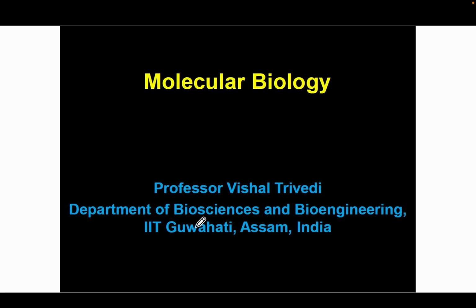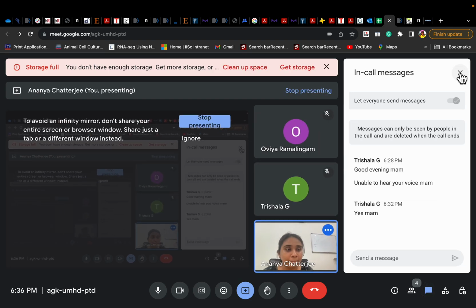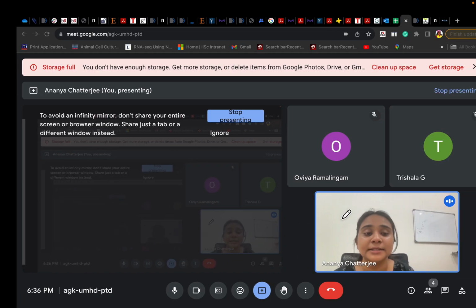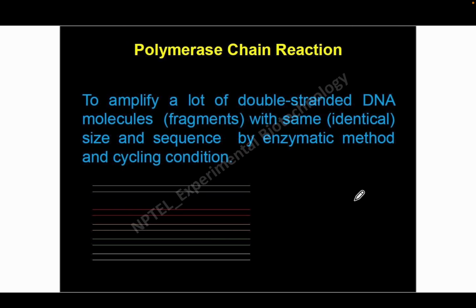Now today I will be starting with molecular biology, week 9 content. These slides are from Professor Vishal Trivedi, which you also see in NPTEL. So we will be discussing these slides. If you have any doubt while you go through them, you can let us know. We will be starting with today's discussion on polymerase chain reaction or PCR.